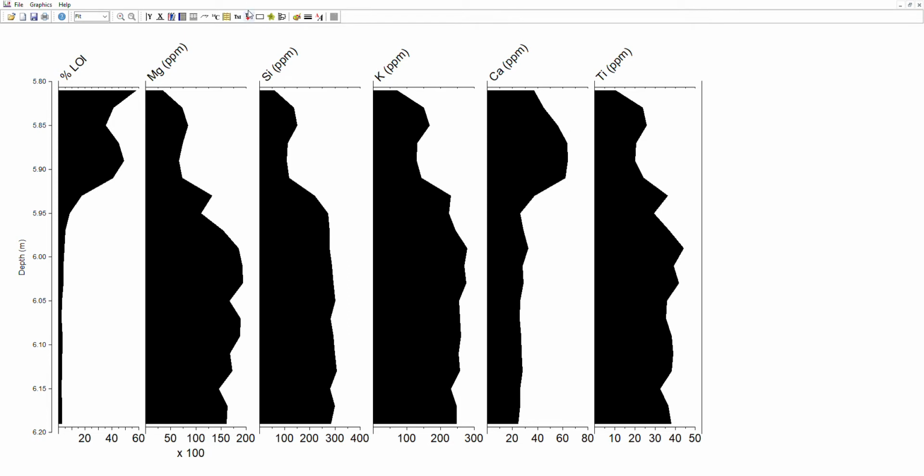The silicon is different, obviously, so I'll do that one just to show you that again. So times by 1,000 this time to get up to parts per million. We have that at the same height, so minus 0.7. I'll change that to 25. OK that, and that's there now. Okay, and for completion, we should put times 100, times 100, times 100 down here as well.